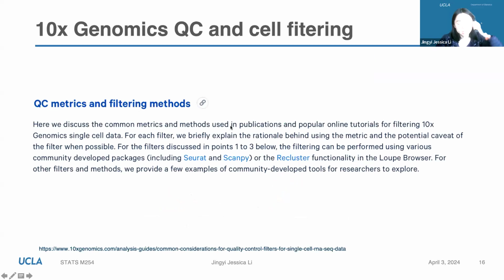Okay, that's in Seurat. But we also have some other references for you from 10x Genomics, which is the kit company, the technology. People use the 10x Genomics kit for single-cell RNA-seq, and it's more standardized than if you develop the experimental protocol in your lab. So we will go use the 10x Genomics website for further information. It has more criteria than Seurat.